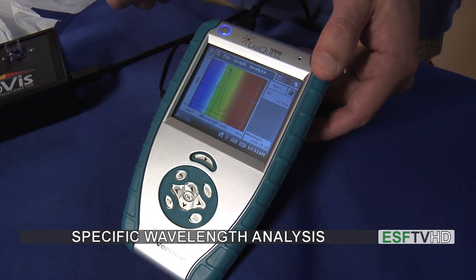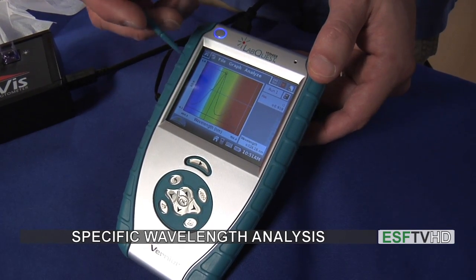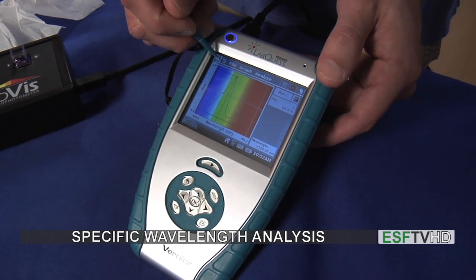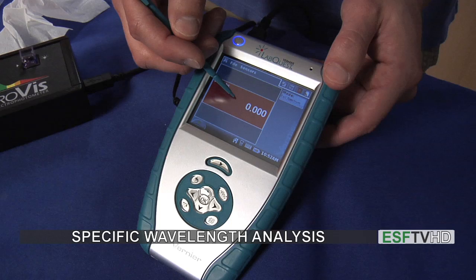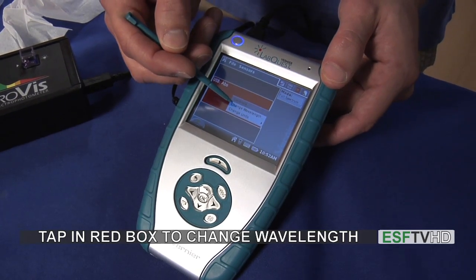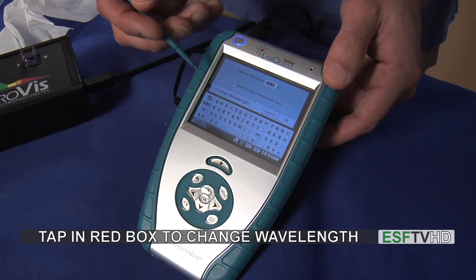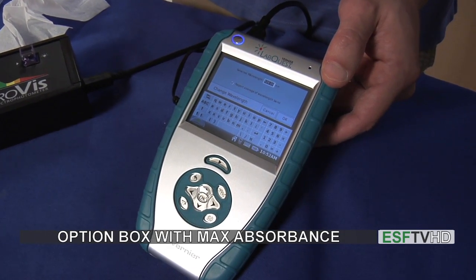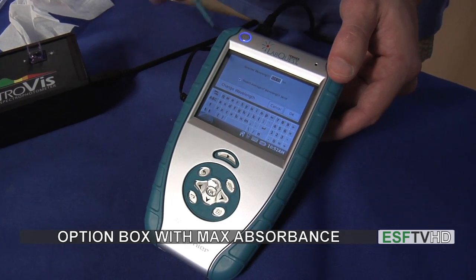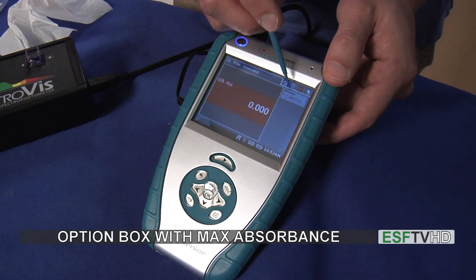Now in the case that I actually want to run an experiment at a specific wavelength instead of running a full spectrum, I would go back to the original screen and click the red box, then click change wavelength. When I click change wavelength, it will automatically highlight the maximum absorbance, which in this case is 524 nanometers. So I'll click OK, because usually we want to look at the maximum.